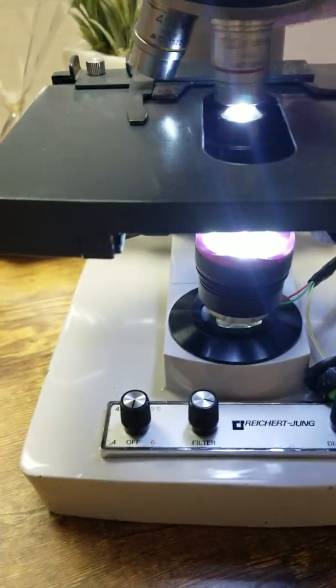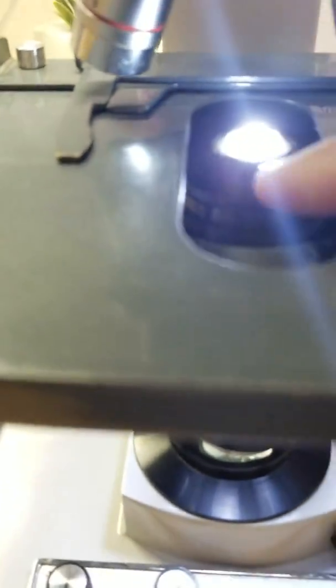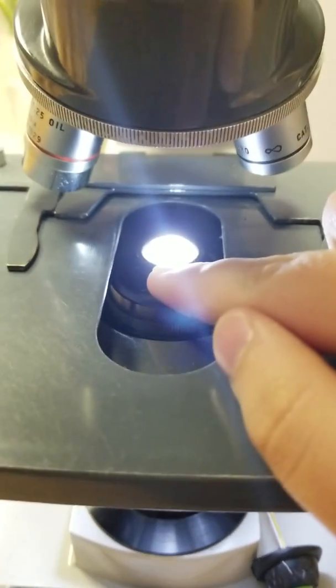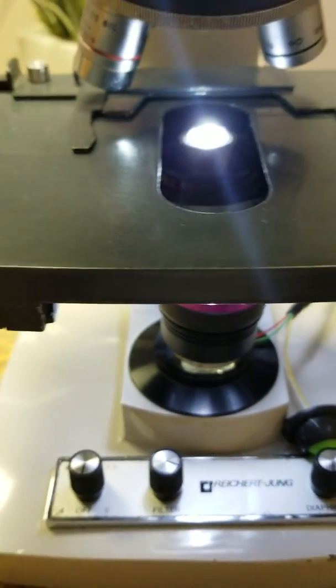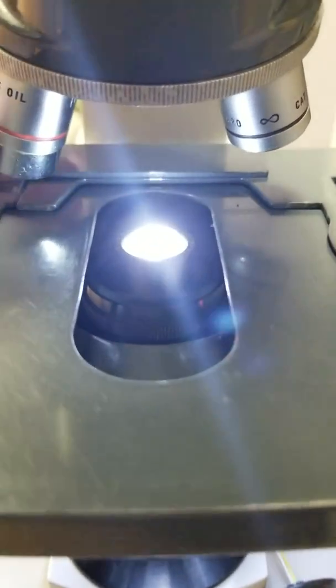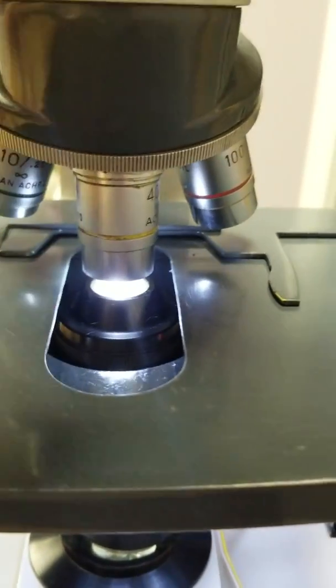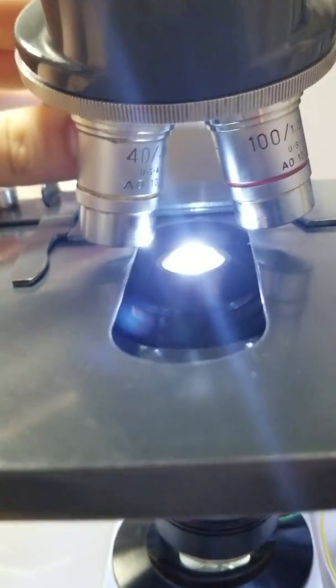So then, since my 40-time objective isn't oil, I just put oil on the condenser. And then that helps to shoot all of the light right into the sample and have it help it reflect. And then I just turn my oil on, or not my oil, I turn my 40 on.